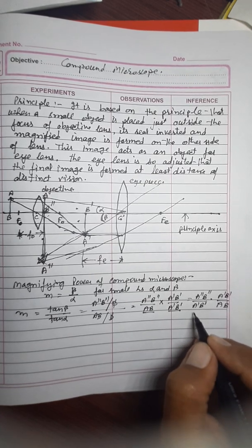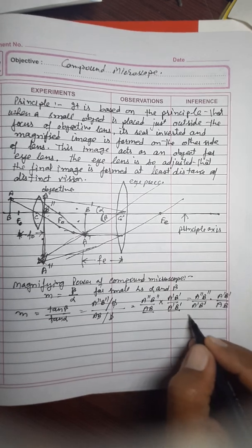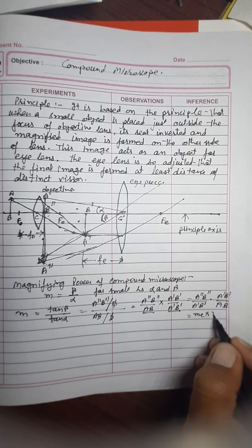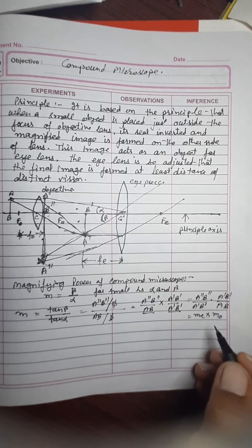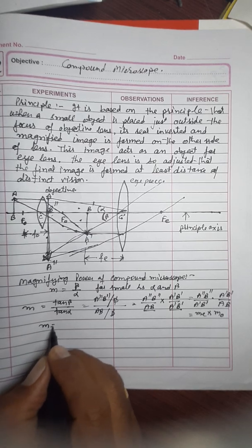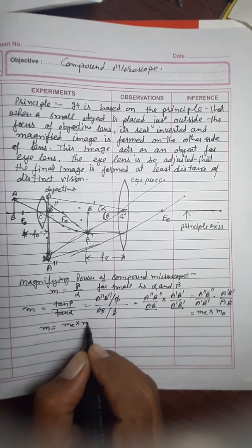This is the magnification of the eyepiece and this is the magnification of the objective. Therefore, the magnification of the compound microscope is M_E into M_O.